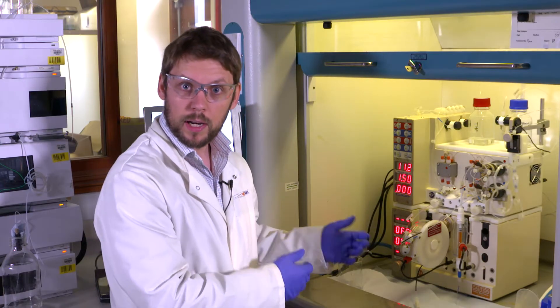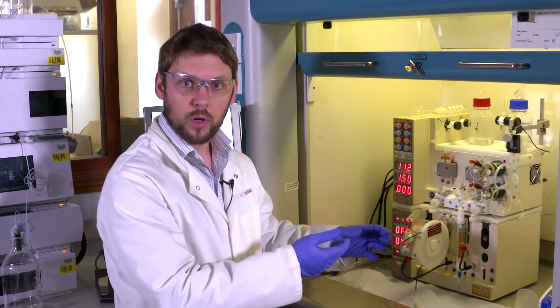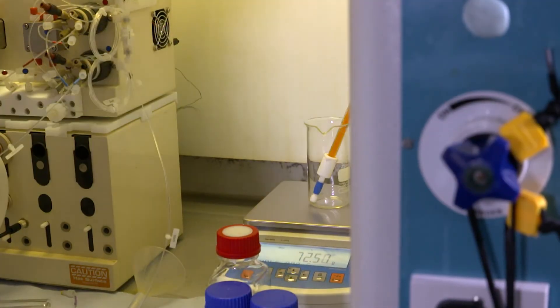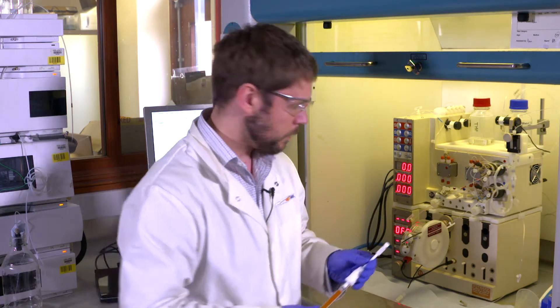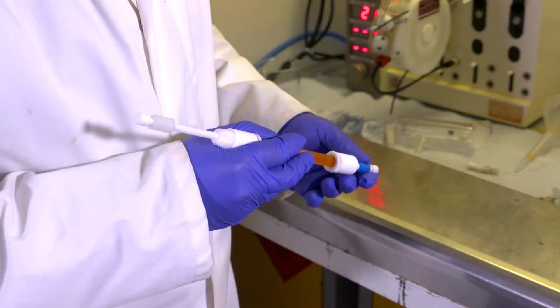Now I'm happy that the column is full of solvent and I've got rid of any extra air bubbles. I need to stop pumping and re-weigh my column to find out what that volume inside must be. Now I know the mass of the column with the solvent inside I can work out what the volume must be using the density of the solvent that I used. Now I know the dead volume inside the column I can put it back on the system and get ready to run the reaction.